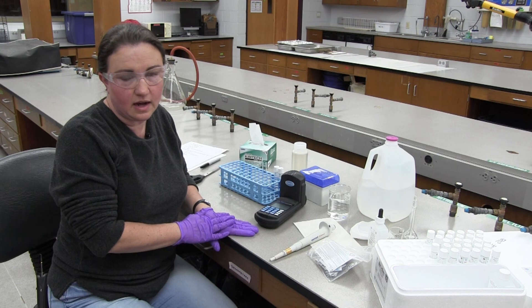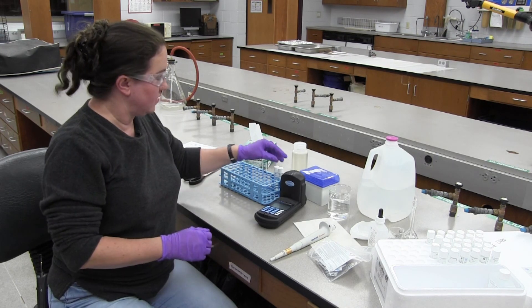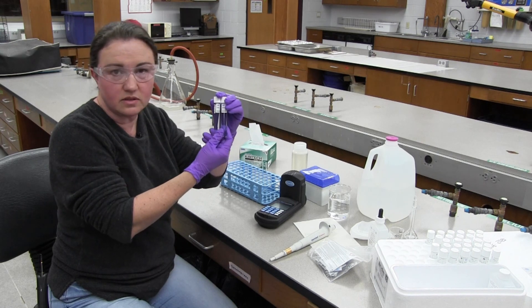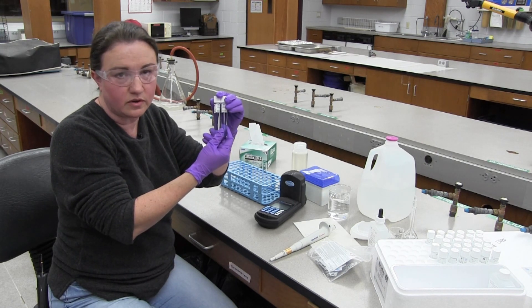Now that we're finished with the phosphorus test, you want to dispose of the tubes in accordance with university regulations.